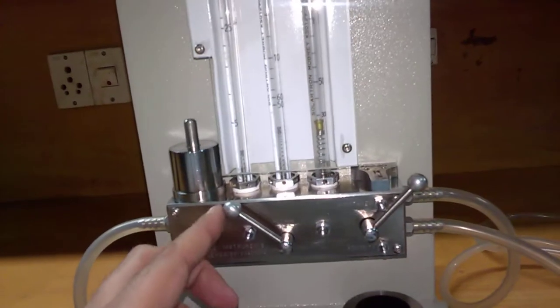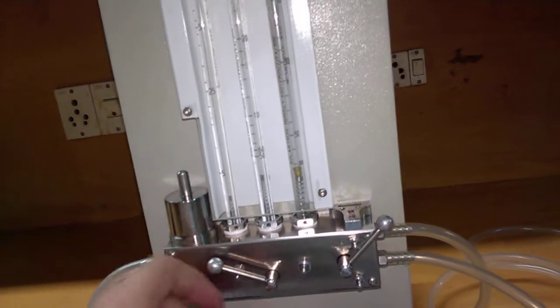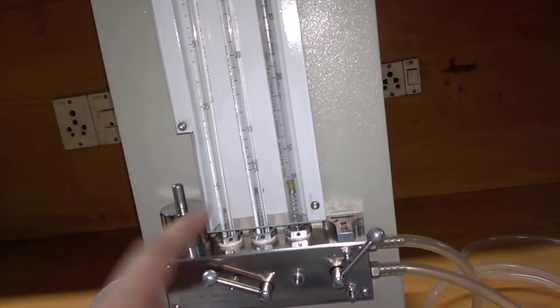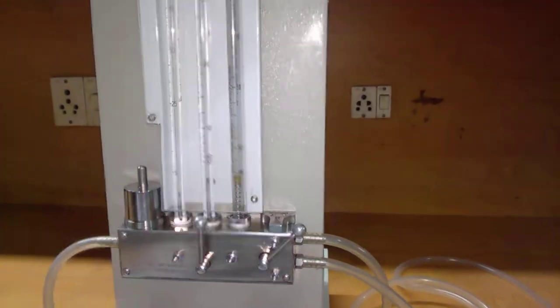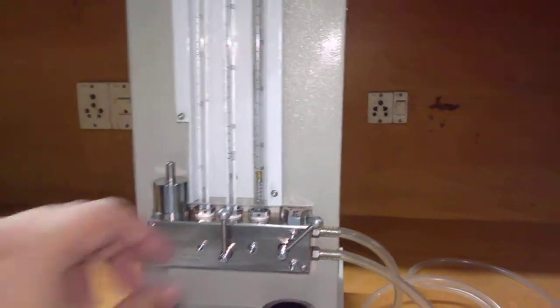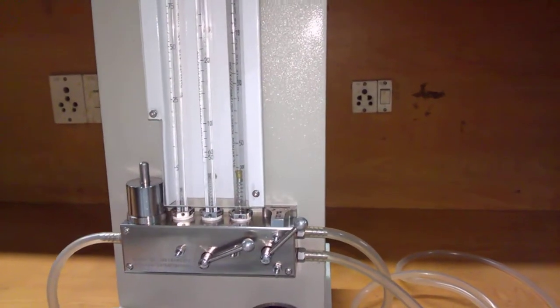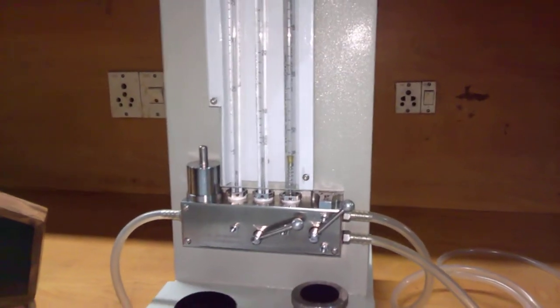The tube selector has three positions: this position selects the tube from 5 to 150 ml per minute, the middle position selects the tube from 50 to 500 ml per minute, and the rightmost position selects the tube from 300 to 3000 ml per minute.